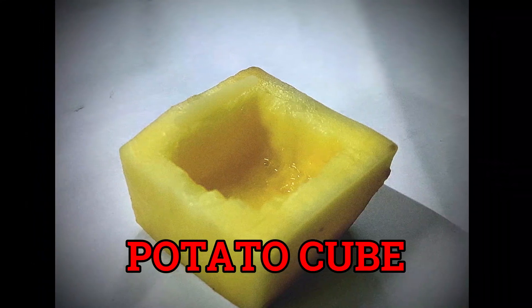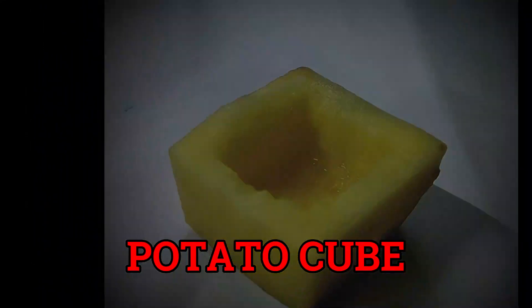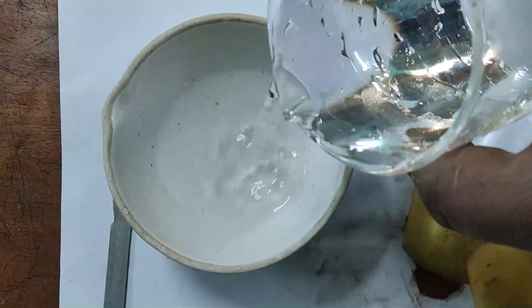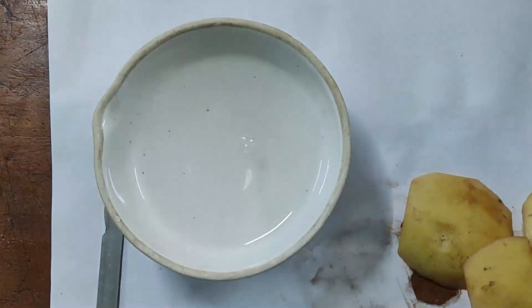First, we will take a bowl and pour distilled water into it.